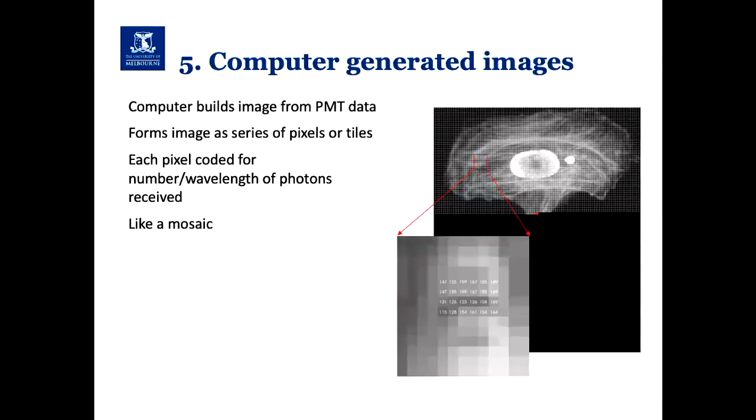Okay, final thing is how do we generate our image? I've been mentioning that we're scanning our laser across our sample. Quite often on confocal systems you'll see something called a pixel dwell time. That's essentially how long it took the laser to scan across the sample. We're collecting photons all that time, and then we're assigning all the photons that came out of that time period to a single pixel. So essentially, although you're generating an image at the end, it's basically an array of numbers.